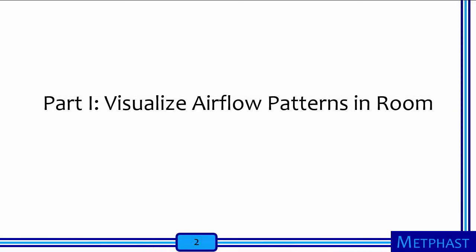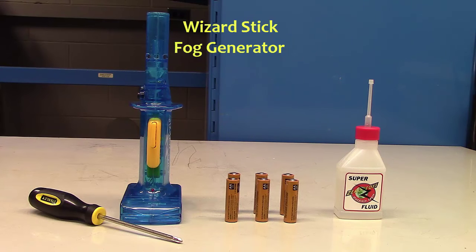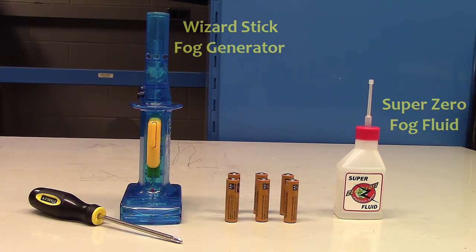The first part of this activity will focus on visualizing airflow patterns in a room. Sometimes airborne exposures are invisible to the eyes, so airflow visualization is the art of making airflow patterns visible to us. The wizard stick is a fog generator and we will use it to visualize airflow patterns in this activity.